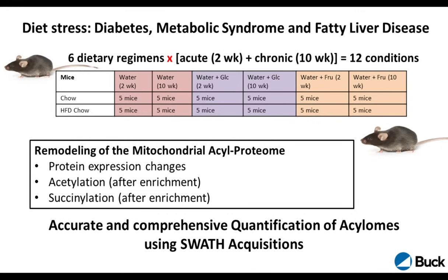Basically we were having different feeding regimens. Let's go to the next slide. Yeah, and so basically we were feeding these mice and looking at acetylation and succinylation, so the acetylome, the succinylome, and also at the protein expression changes.